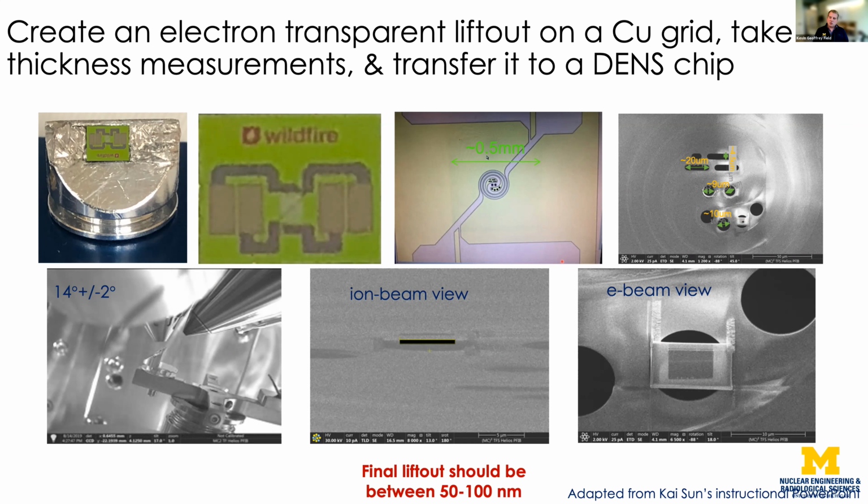The nice thing about doing a FIB-based technique compared to the previous electropolishing techniques is that you can now do targeted lift outs. So you can say, I want a 100 zone axis or a 111 zone axis, whatever crystal orientation. You can lift that out, land it, know you're going to be there. So if you do the fancy things with considering angles, remember your geometry from high school, and then also know your crystal orientations, you can sort out all of those details in order to get a perfect specimen.